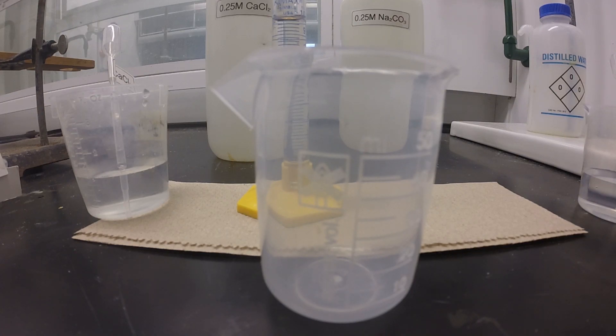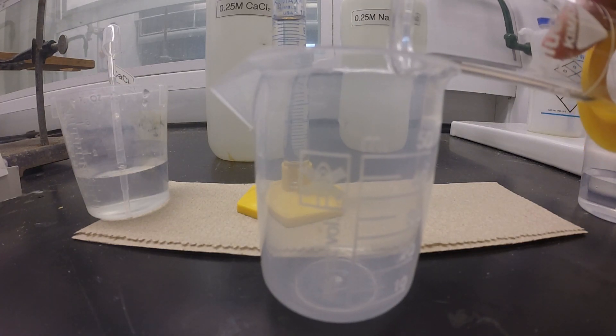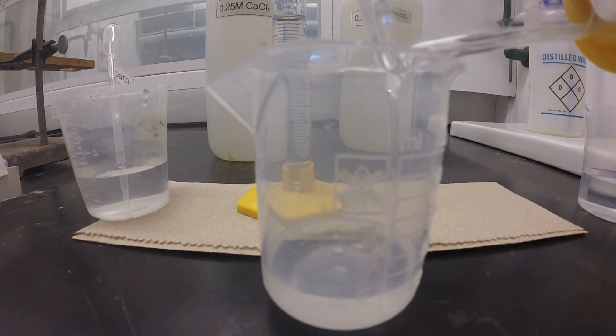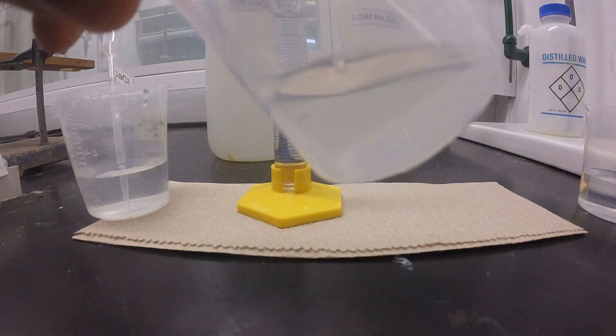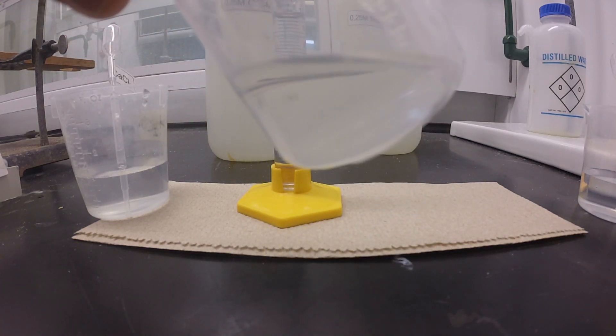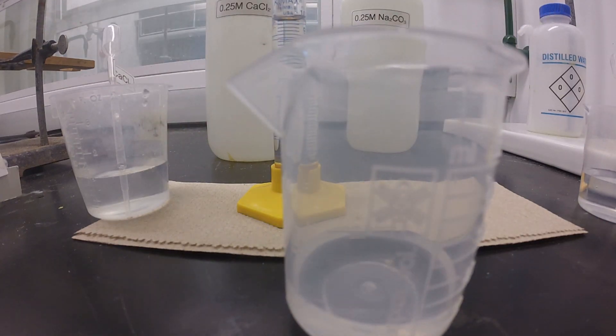Now that the filter paper is draining, we're going to do the reaction. First I'm going to add the 15 mL of the sodium carbonate - you can see again that this is a clear solution, there's no precipitate in there. Then we're going to add the 10 mL of the calcium chloride.